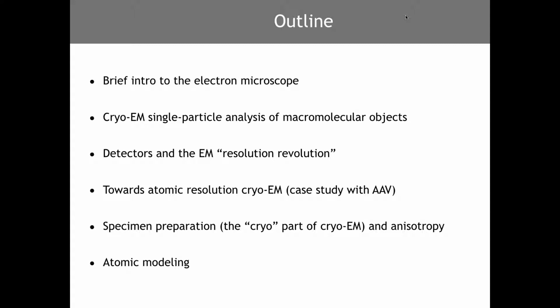Some of our latest work towards atomic resolution, really truly atomic resolution, cryo-EM, and a case study with AAV. And then talk about some of the challenges, particularly with specimen preparation and the effects of anisotropy. And if we get to it, just the latest with atomic modeling.